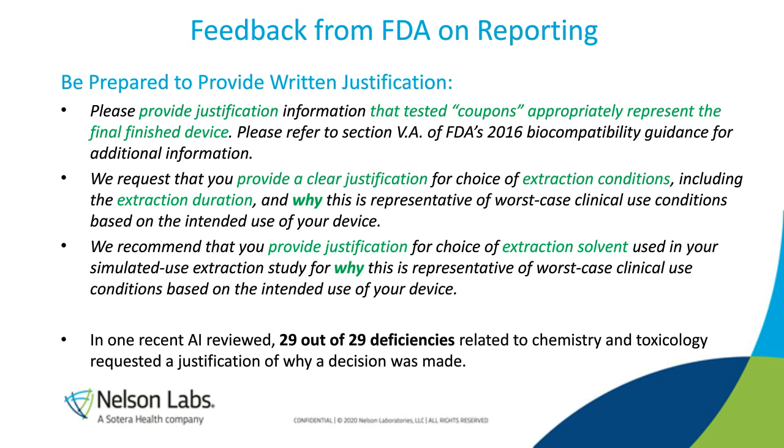But in the past, you could include those conditions just as a matter of policy and expectation on the part of regulators. It's something like, we're standing by something decided, 50 degrees C for 72 hours. But what we've been seeing more and more is if you use 50 degrees C for 72 hours or if you use exhaustive, it's not just enough to say we extracted exhaustively.